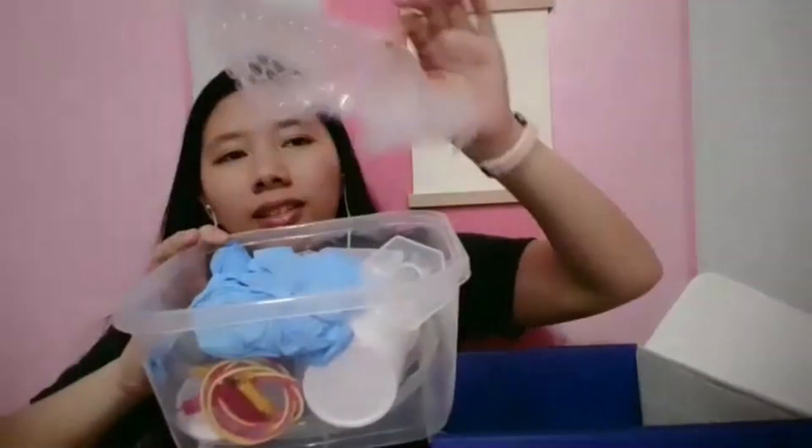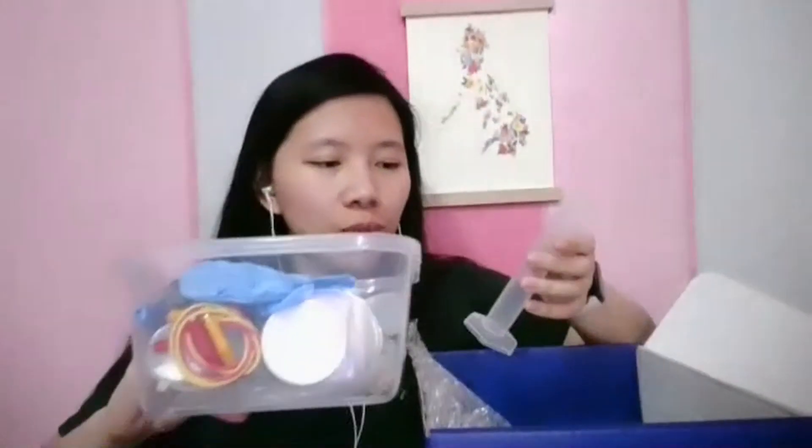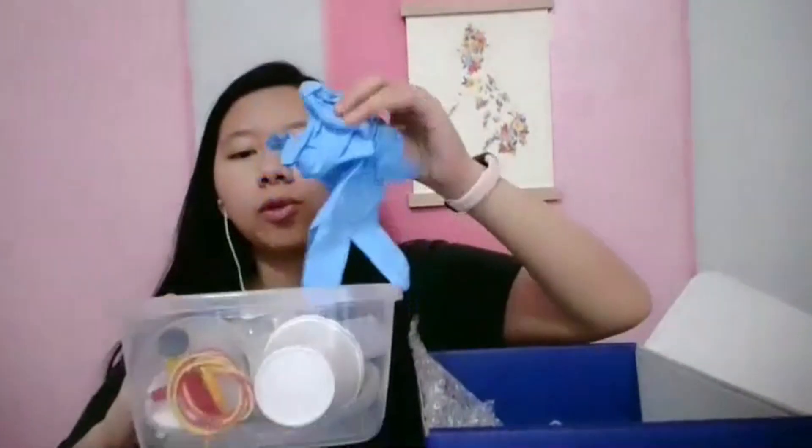You have a plastic tub included in your kit. This can double as both a container as well as storage for the rest of the stuff included. Inside are other knick-knacks that you might be needing for the experiments — it's actually packed really well with bubble wrap to protect your stuff. Instead of glassware, you have plasticware, but they do the job. This is a graduated cylinder that's 25 ml — I believe the graduations are 1 ml each. There are also gloves included for your protection, especially for experiments that require you to deal with mixing or handling reagents.